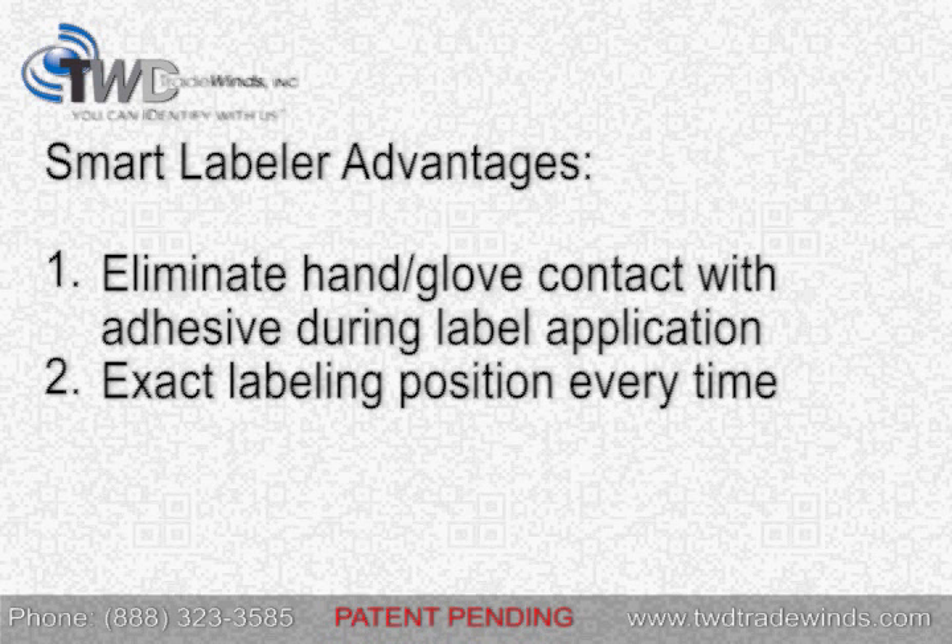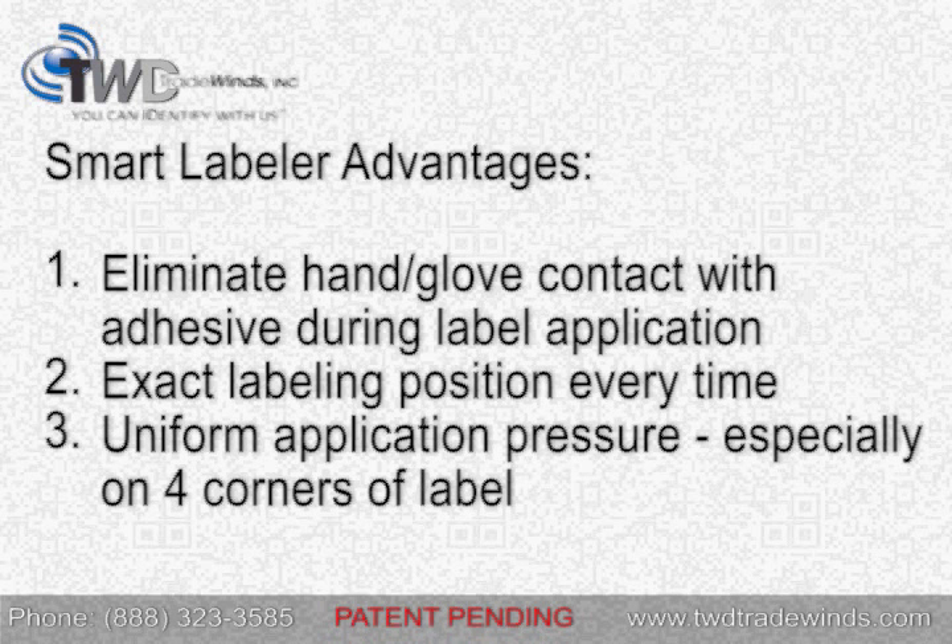Second, it retains the exact label placement position every time. Third, the machine applies the label with uniform pressure, especially on the four corners of the label. This helps to prevent labels from peeling away from the labware over time.